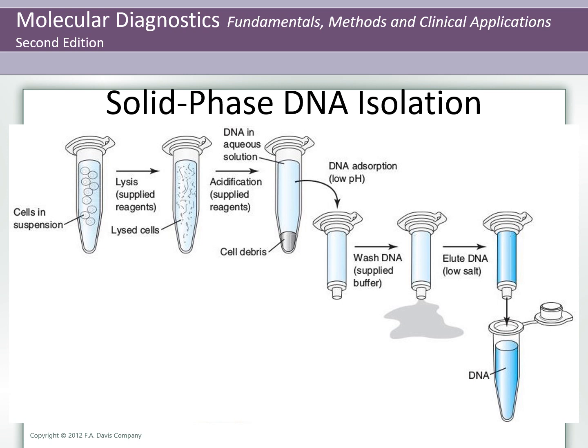For solid phase separation, the cell lysate is applied to a column in high salt buffer, and the DNA in solution absorbs to the solid matrix. After the immobilized DNA is washed with buffer, the DNA is eluted in a specific volume of water, TE, or other low salt buffers. Of note, TE is the Tris EDTA buffer.